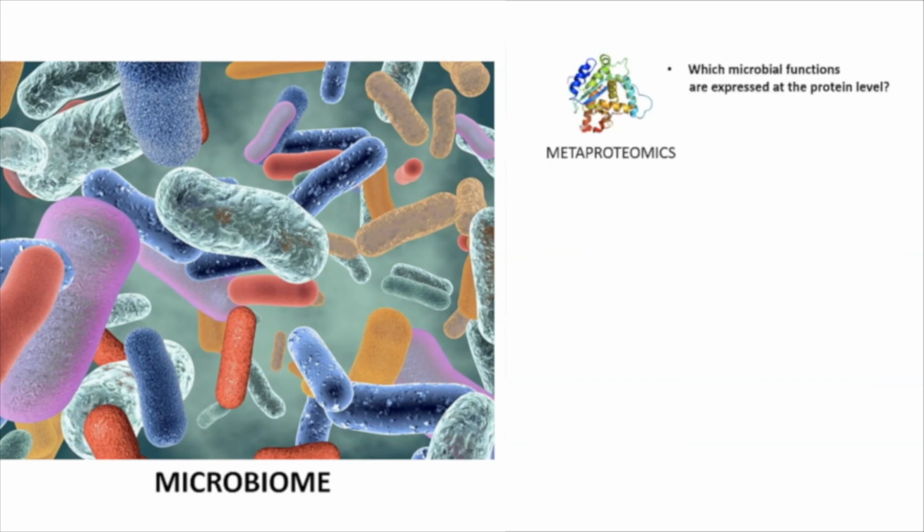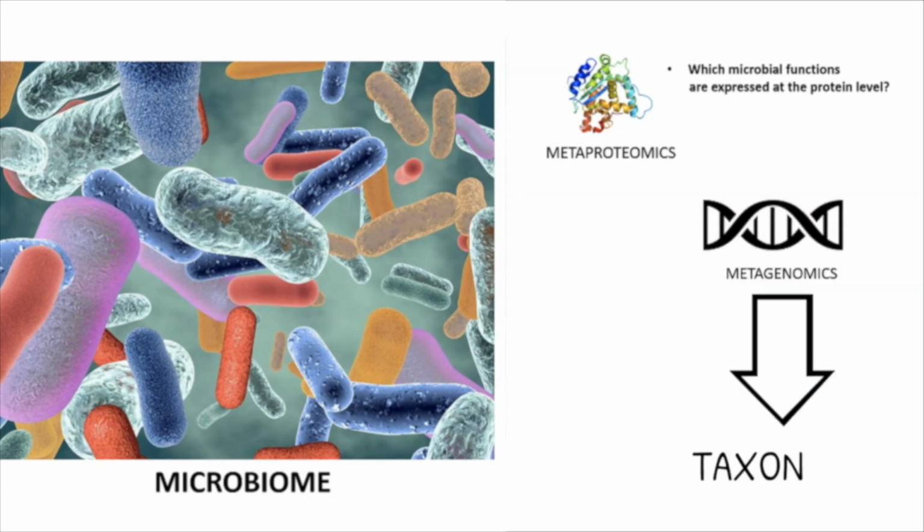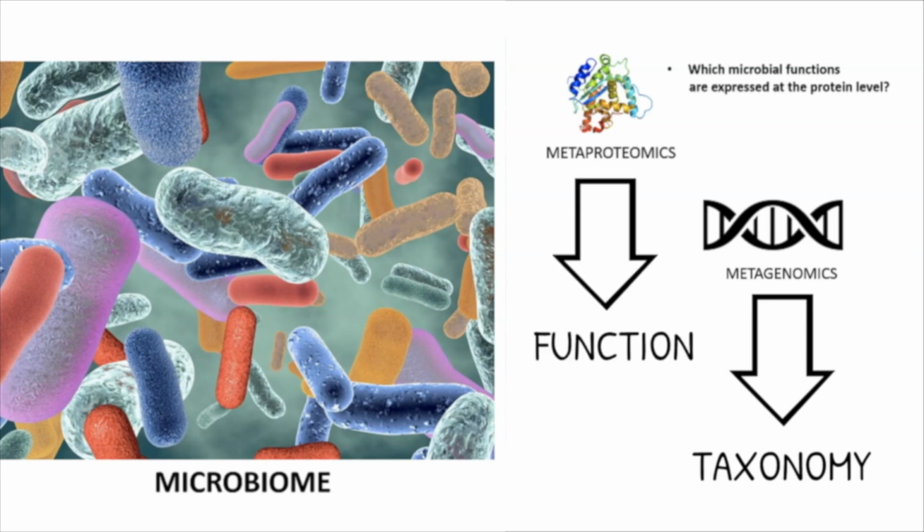Metaproteomics involves mass spectrometry analysis of proteins expressed from microorganisms within a host, such as a human. This provides a look at molecules from microorganisms which may interact with the host and contribute to health and disease such as cancer. When combined with metagenomics, which can identify which microorganisms are present, metaproteomics gives a more complete picture of molecular contributors and possible functions from microorganisms, such as bacteria in cancer.